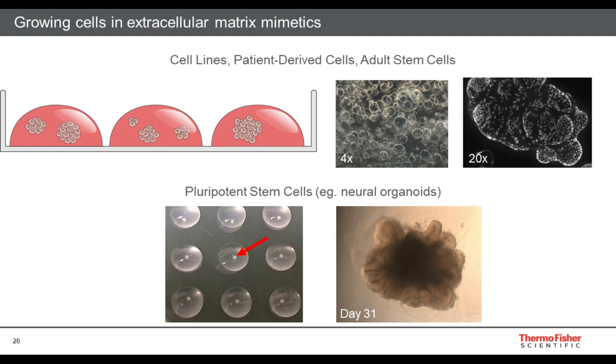So adult stem cells are grown in this way, where cells isolated from tissue are resuspended or reconstituted inside of an extracellular matrix. And many of them grow into what almost looks like bubbles inside the gel. So they form these cystic-like structures, but if you actually stain them with something such as DAPI, you can see that there are these cellular models. These are lighting up all the different nuclei representing all the different cells in a given model shown here on the right. But this really only works if you're growing cells inside of an ECM.